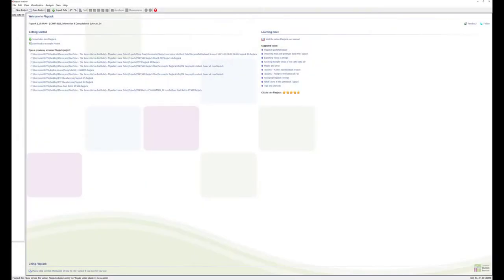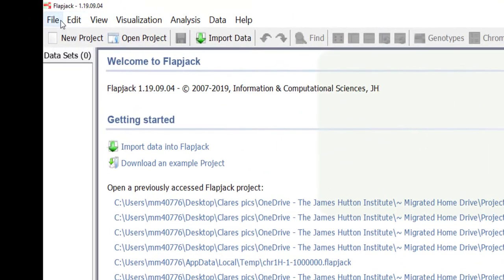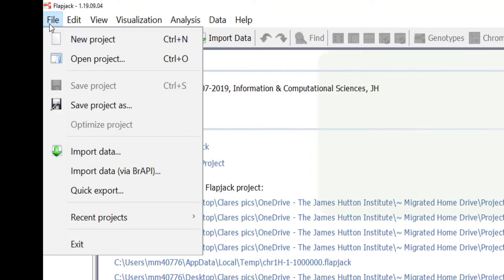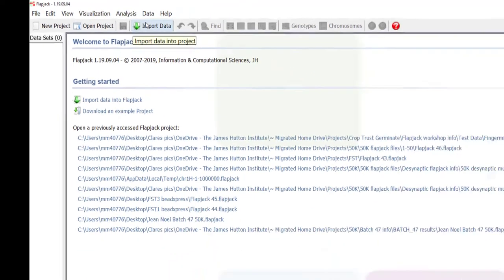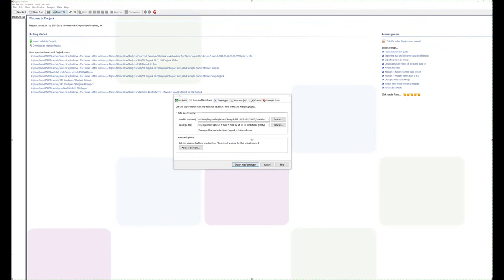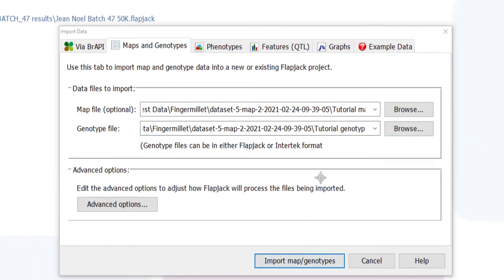Now we have Flapjack downloaded and our input files created, we are ready to import our data and create a Flapjack project. Data can be imported from either the file menu or the icon ribbon options. Select the type of data you'd like to import from the selection of tabs in the import data window.